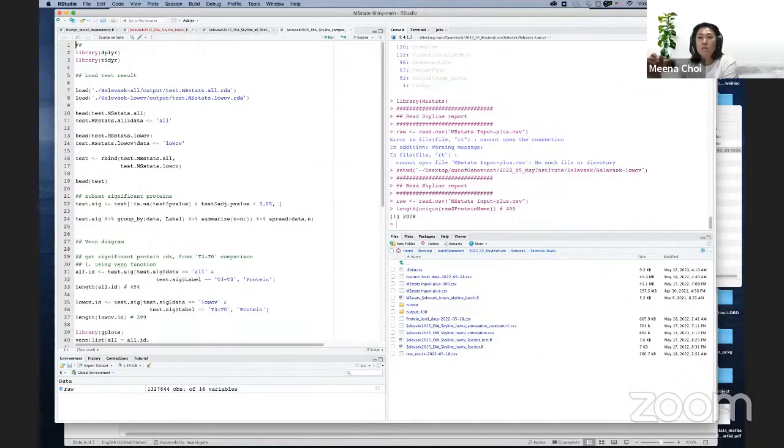As for the protein level, my question is whether the protein level distribution should be equal. At the feature level, the data is original and there is much more variance and many more intensities there. I think that is more suitable, but for the protein level I still have a question mark. It's hard to strike a balance, but I try to keep the feature level and not perform protein level normalization.